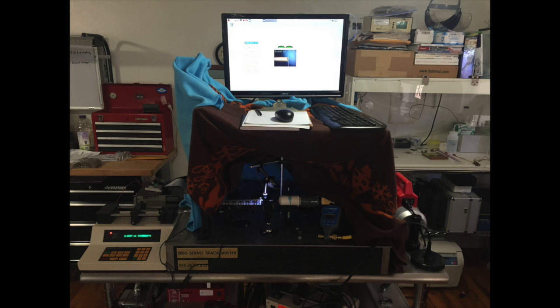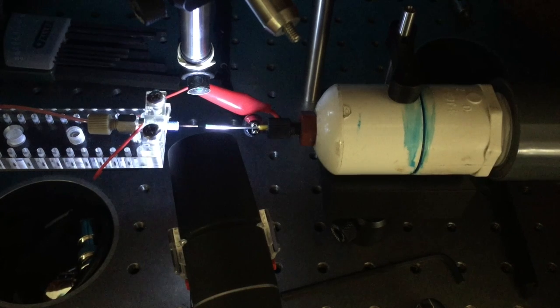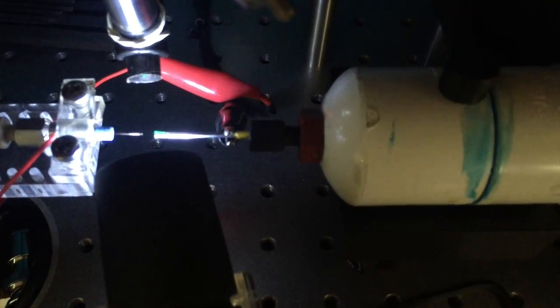A method of control and data collection was developed to manage the DSMS experiments and to form the platform for initial automation of this process.